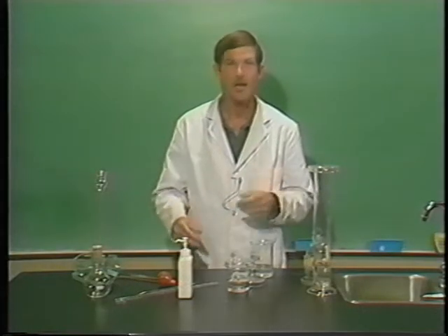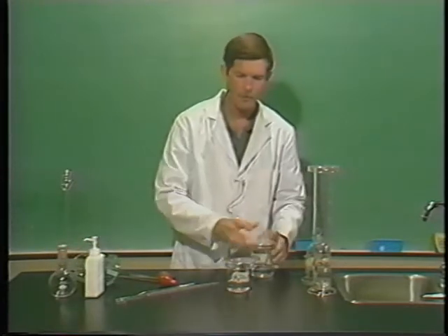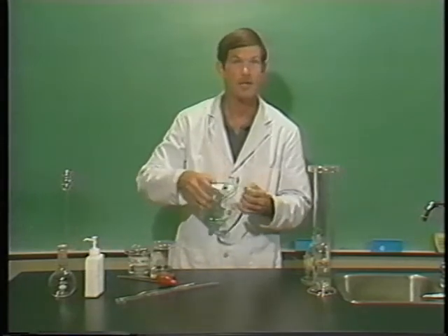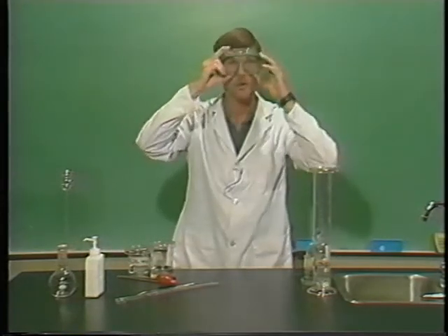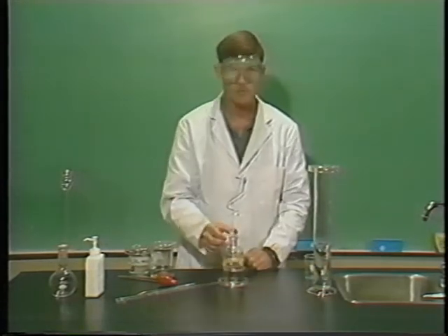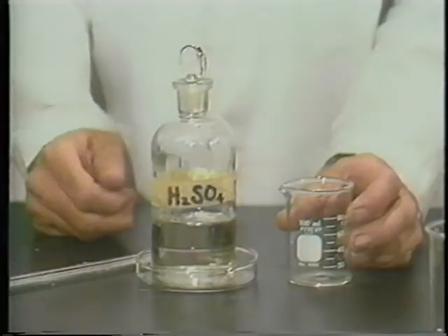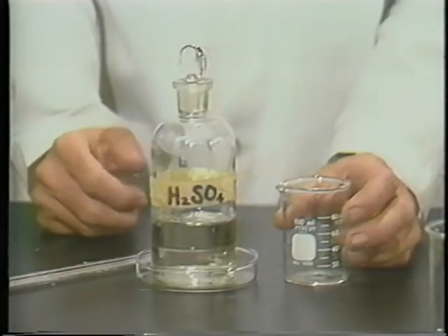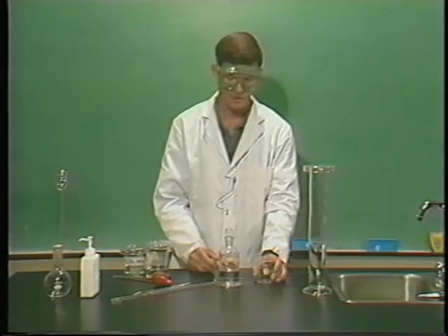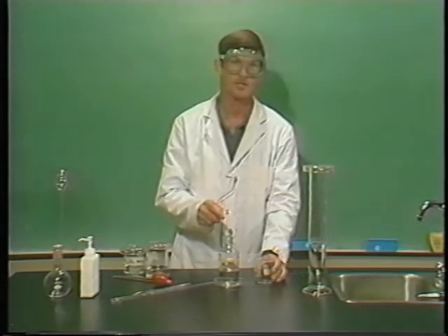The first step is to have a clear working area, so we'll move a couple of these things aside. Step number two is to make sure that you have your safety goggles on, because acids, as I said, are very nasty chemicals and you don't want to get any acid in your eye. What we're going to do is take some acid from this reagent bottle and pour it into this beaker. Notice that the reagent bottle is sitting in a Petri dish. This is to make sure that if there are any drips, they'll fall and collect in the Petri dish and not touch the table. The other important thing to remember is never let the glass stopper touch the table.